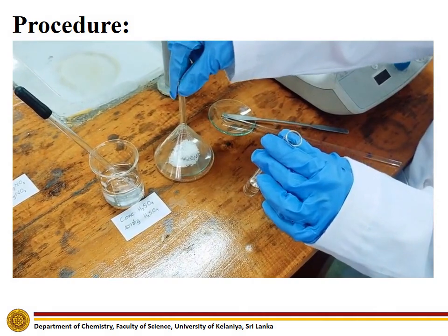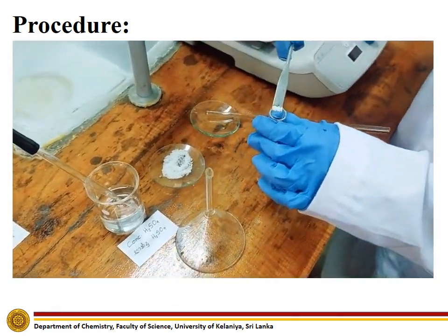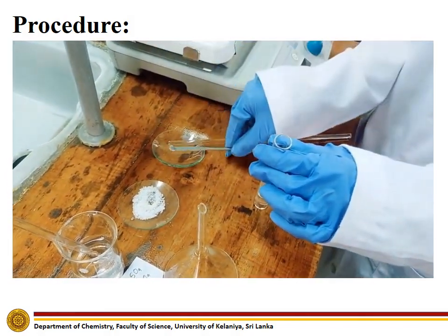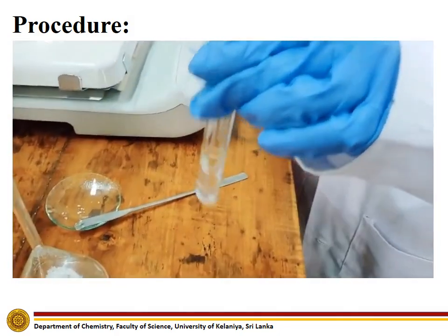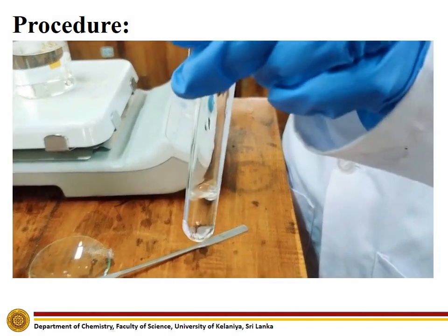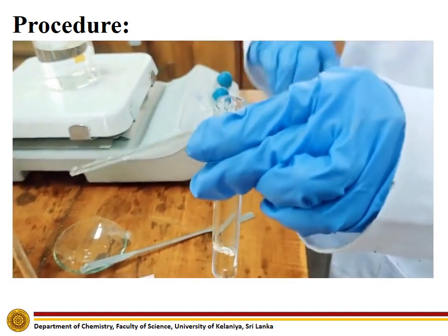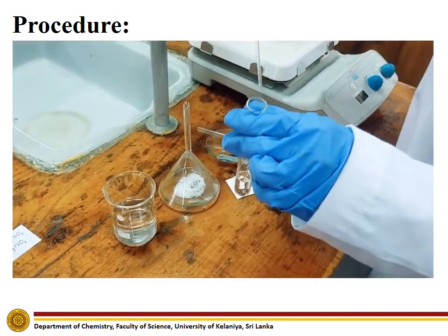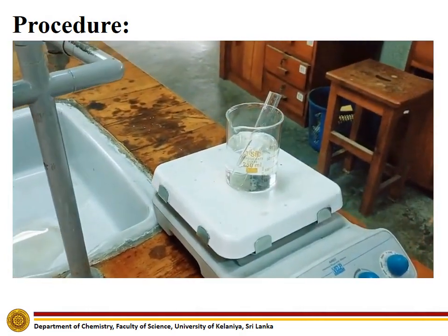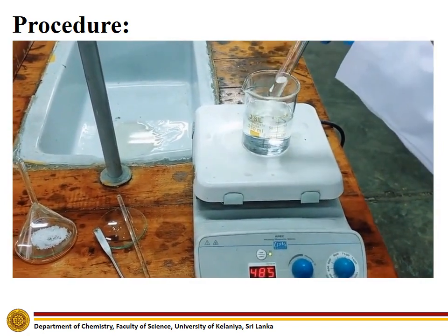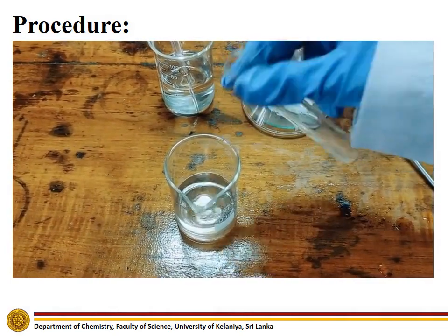To carry out the fourth experiment, first add benzoic acid to a test tube containing ethanol and dissolve the solid in ethanol completely. After the solid is dissolved, add a few drops of concentrated sulfuric acid and heat the mixture gently for about one minute. Take out the mixture and pour it into an aqueous solution of sodium bicarbonate in a beaker and note down the odor.